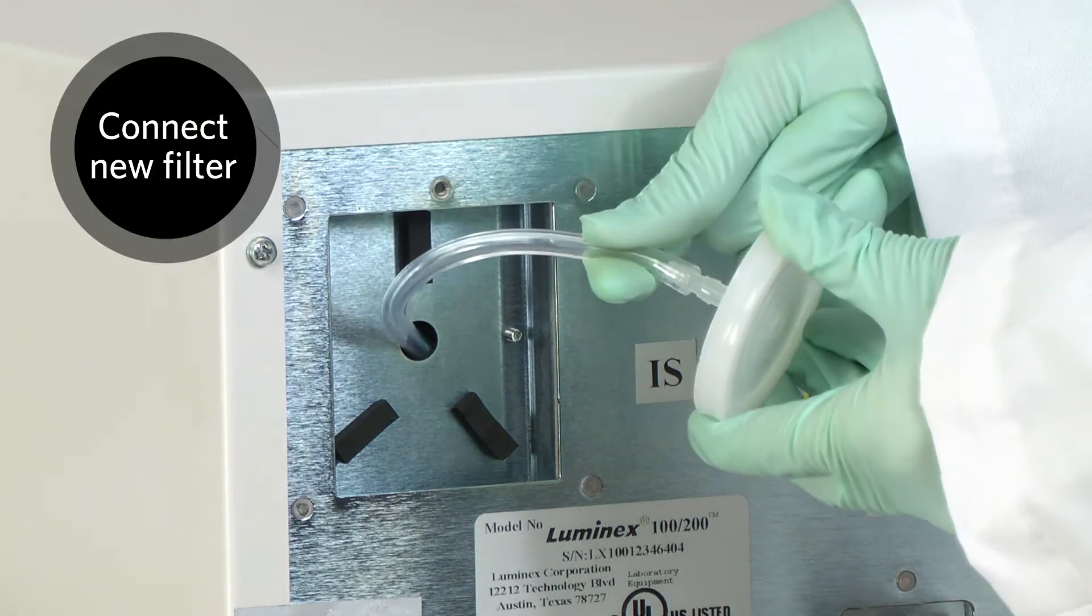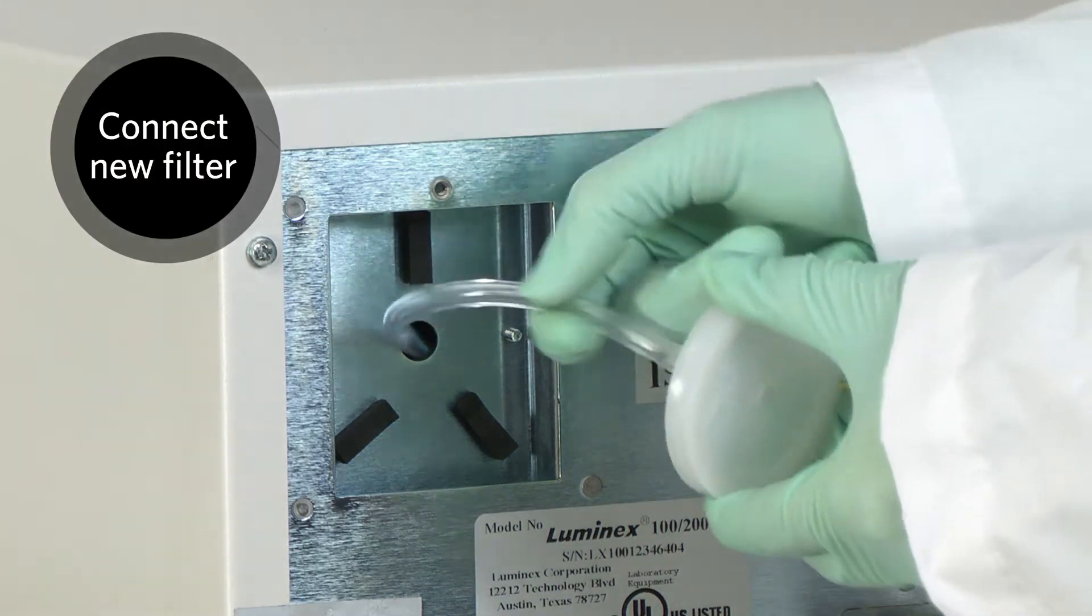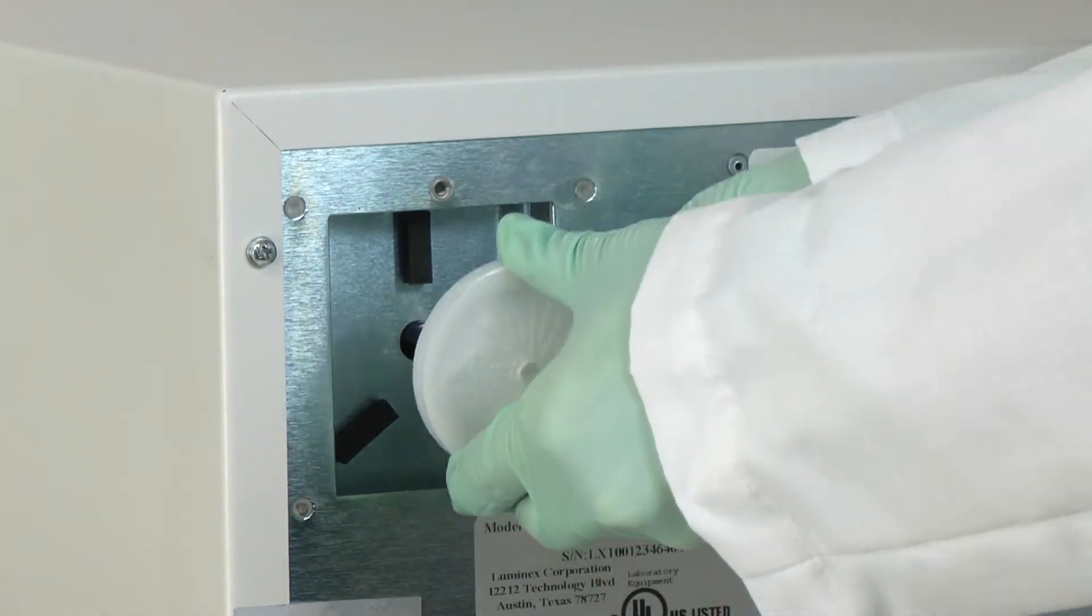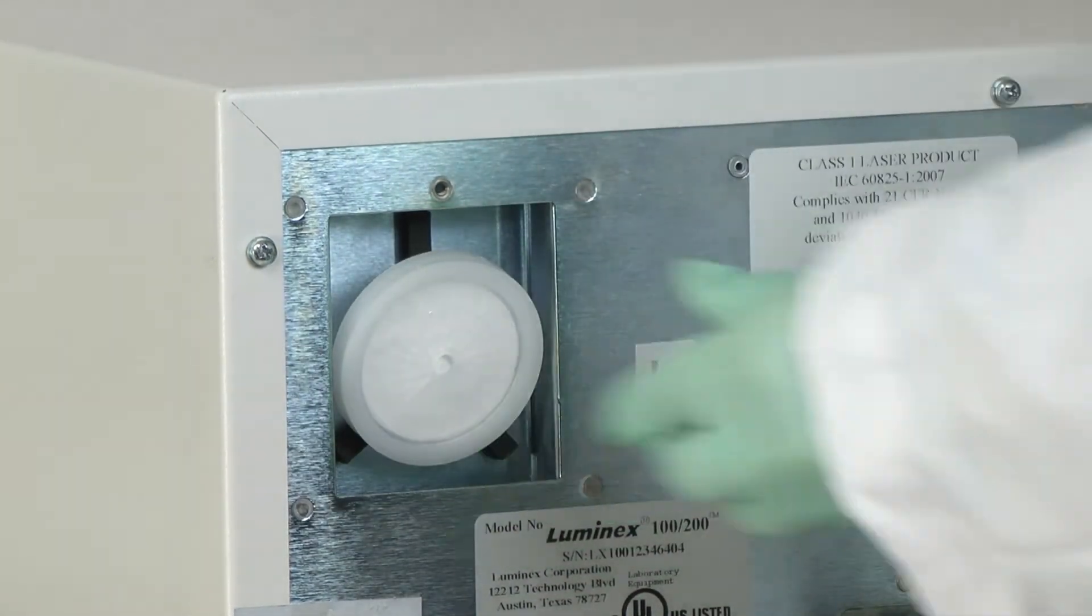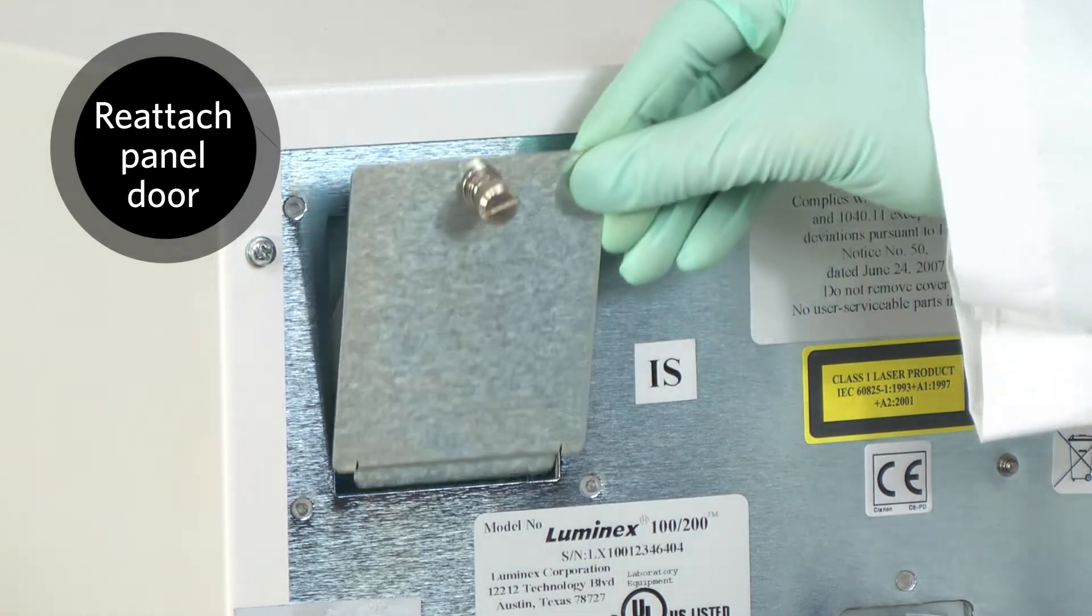Connect a new filter to the tubing and position the filter inside the panel. Reattach the panel door to the unit.